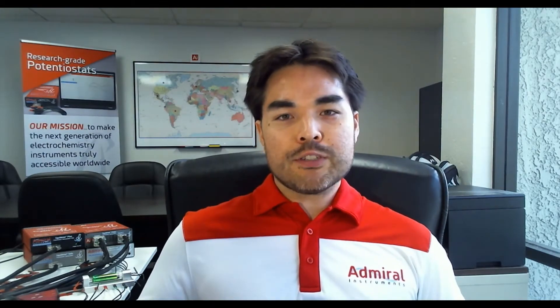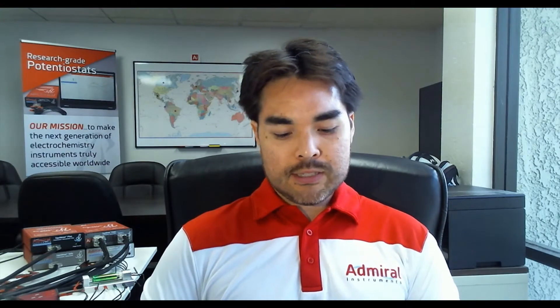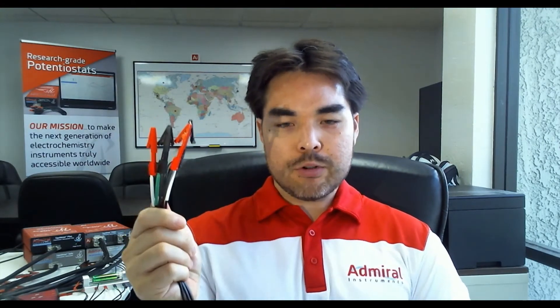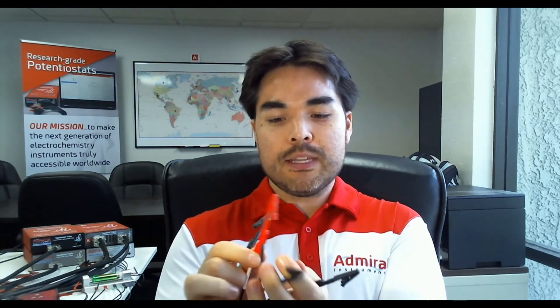All of our different Squidstat models are connected to their experiments with this 90 centimeter long channel cable that features five electrode connections: working, counter, reference, working sense, and counter sense. All of these can be stacked as well to make it easier to connect to smaller samples.